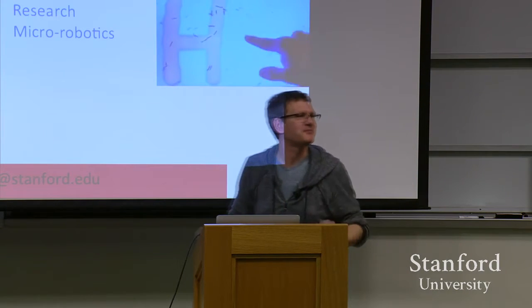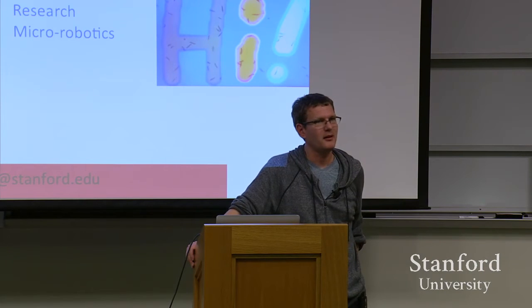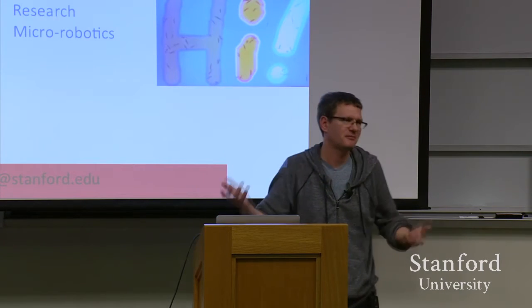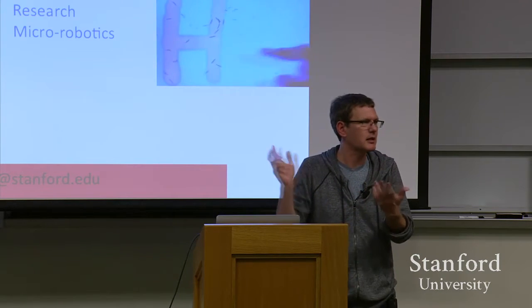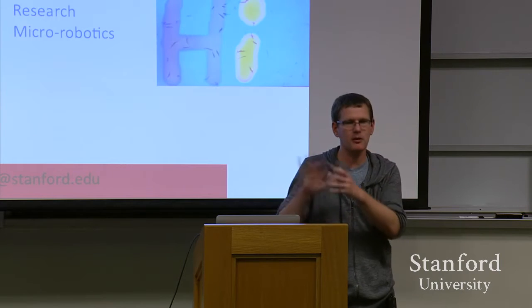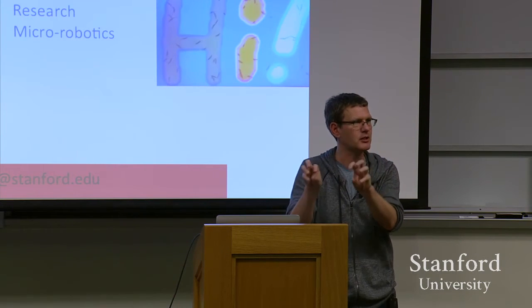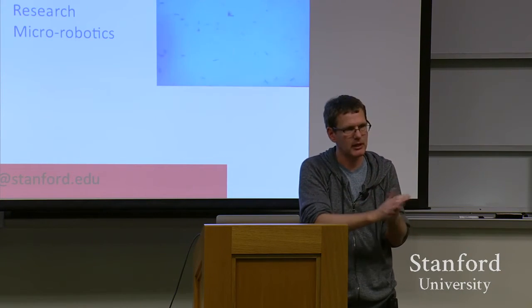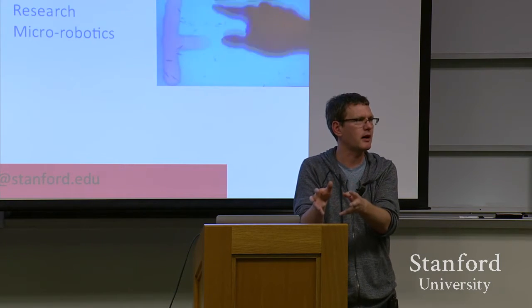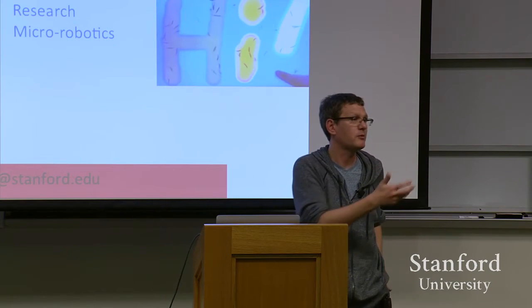Yeah. Does your lab work with the other virtual reality labs on campus much? Seems like there could be some cool stuff. Not yet really, no, not yet. But if these systems get stable enough, it would be cool. That's what I was saying about this abstraction, right? Can we deliver a box like this BPU, which is just digital and the biology is living in there, but whoever, like in a virtual reality lab, can treat this as any other electronic device, as any sort of physics engine? If we can enable that, then I hope that people make interesting stuff with that.